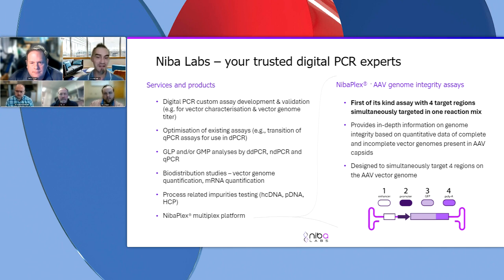So in silico evaluation might give you a really nice score, but then when you try everything in real life, put everything together, you get quite some interaction. So definitely the design as such is a very important part of the assay. And then in the end, after optimizations, data analysis is the challenge as well.